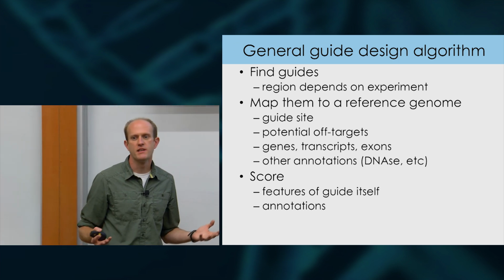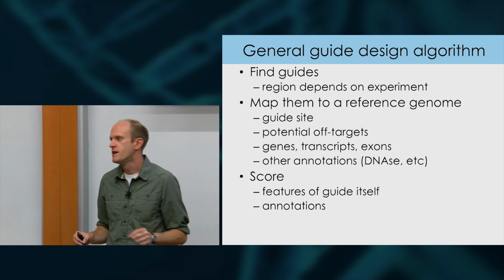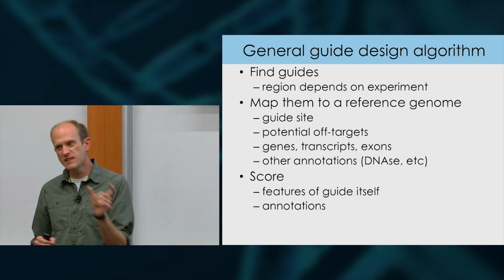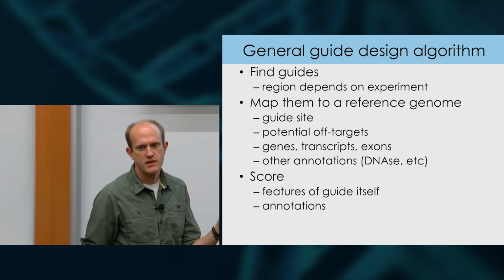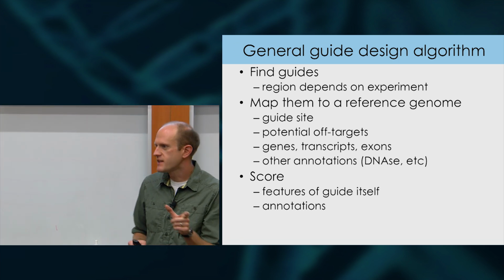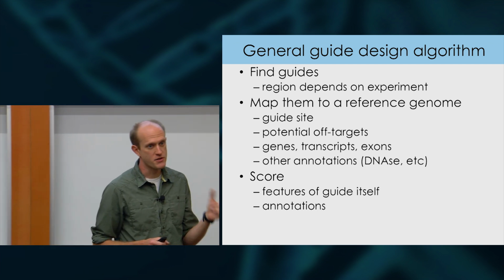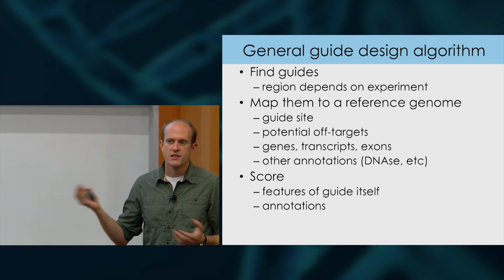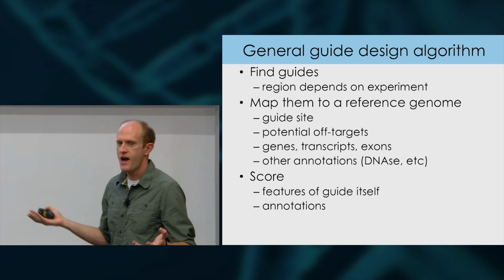into account because it's a really hard thing, right? Lots and lots of variants. So keep that in mind as a caveat. Typically in our lab, what we do is if you have some site that you really, really, really care about, right? Let's say you're trying to do HDR in one particular region. You might sequence that region in your cell line of interest so that you know exactly what that region's sequence is in your cell line, because there are certainly trivial cases where your guide of interest doesn't work because your cell line of interest has a SNP, say, in the PAM, and therefore you're not going to get any activity.